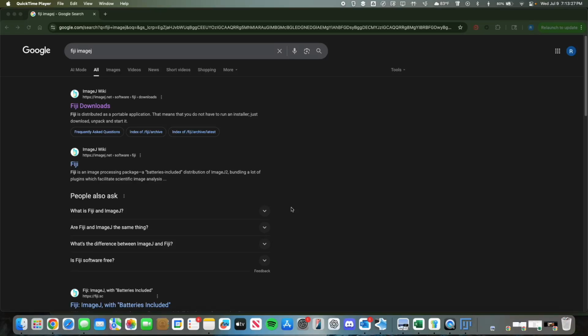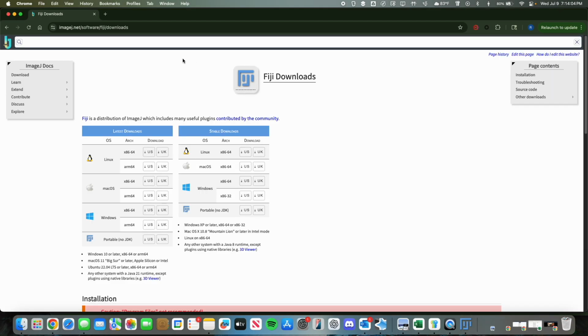How to download, install, and use ImageJ. The primary uses for ImageJ are to retrieve images, quantify lacteal ratios, or for any other image alteration or modification. To get ImageJ, I'm going to put this link inside of the description to download ImageJ.